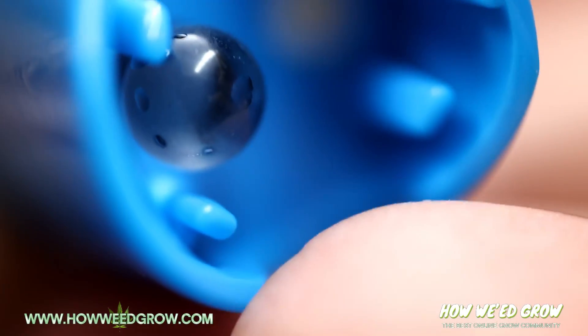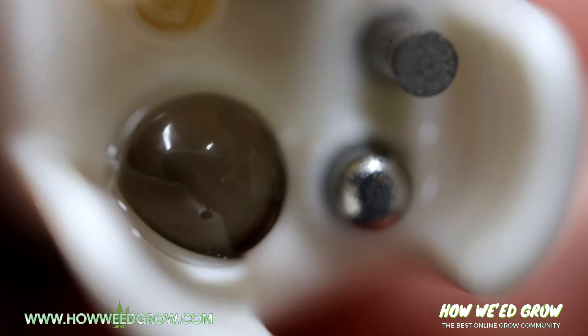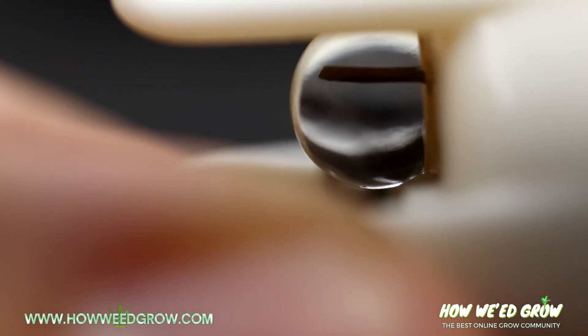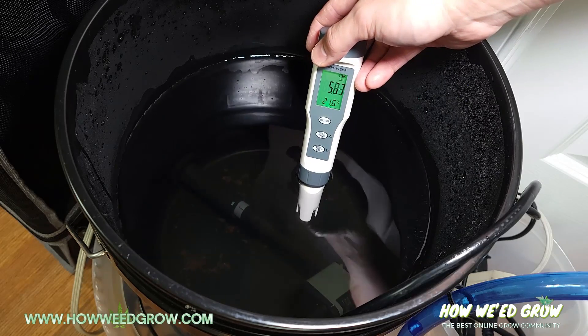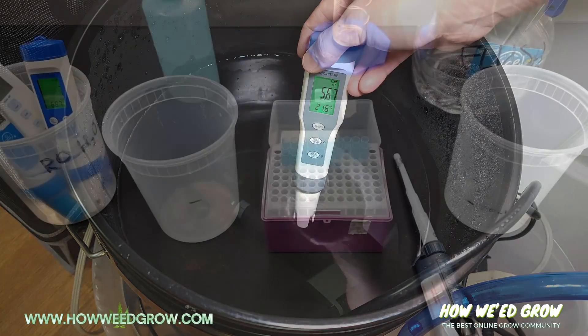A pH meter's electrode is composed of three glass layers that need ions to remain hydrated to detect changes in pH. When it dries, it leads to less sensitivity, which results in drifting pH values, slower response times, and incorrect values.